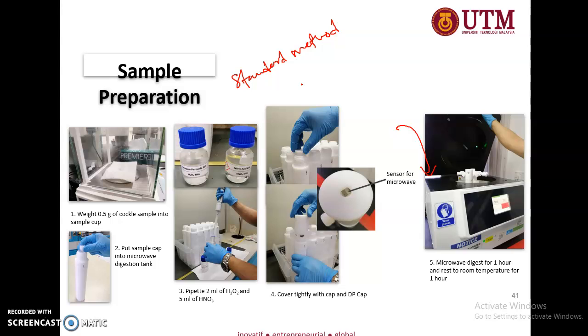There must be a reason we do sample preparation rather than put all those solids inside the tube. Most of the time it is actually to save the tube from being frequently changed, because of the decomposition of the matrix and so on. As I said just now, the tube usually gets thinner and thinner upon usage.